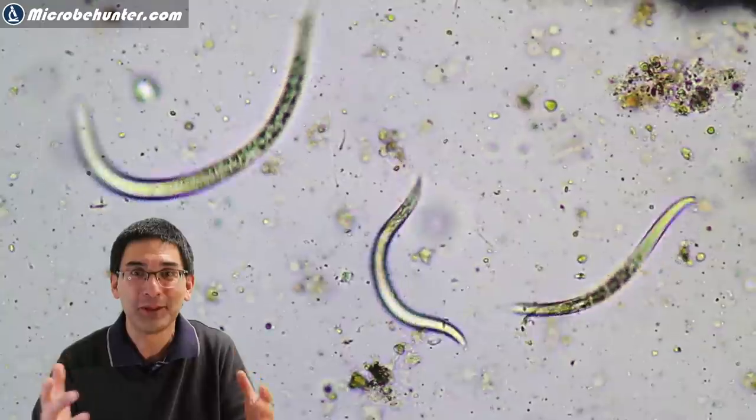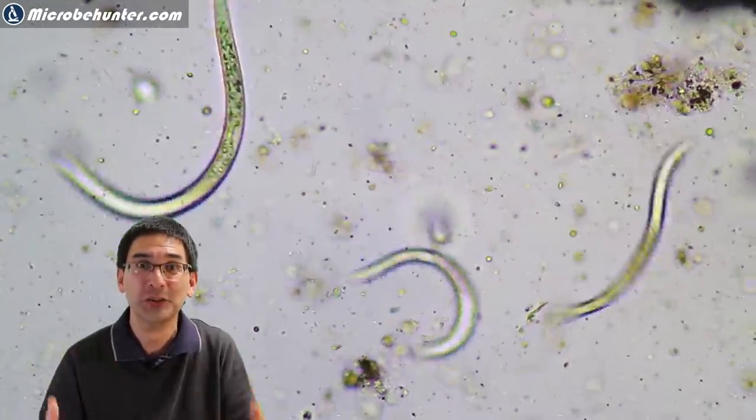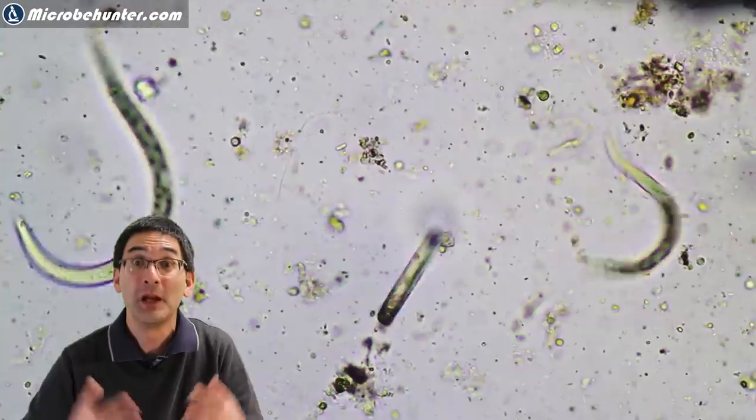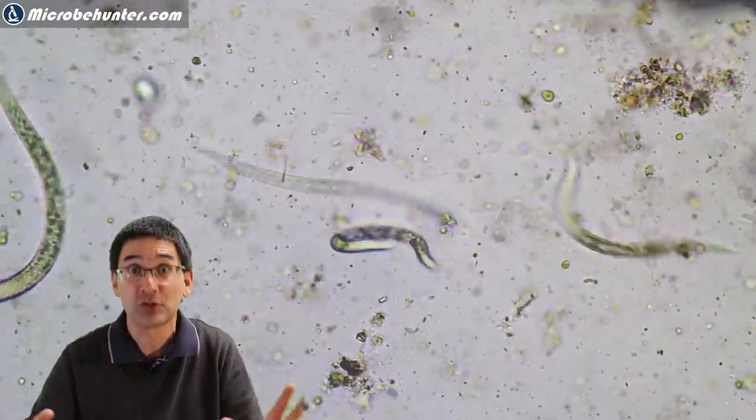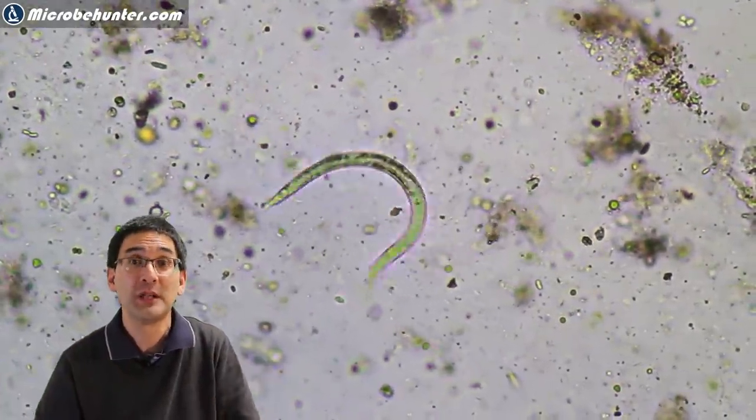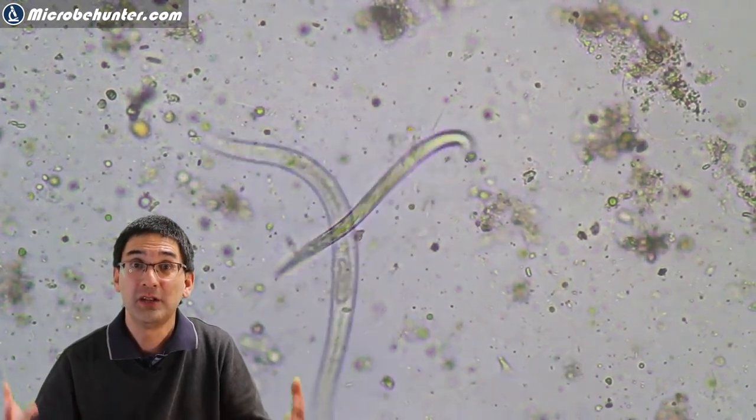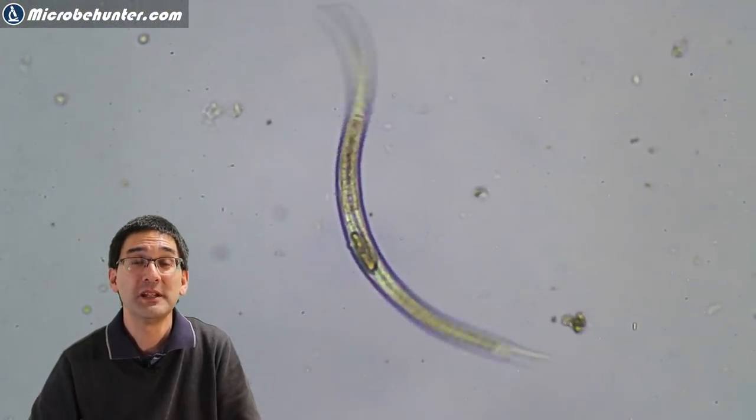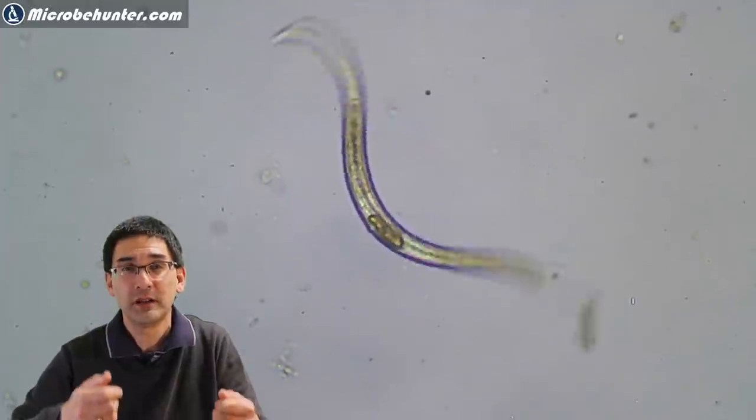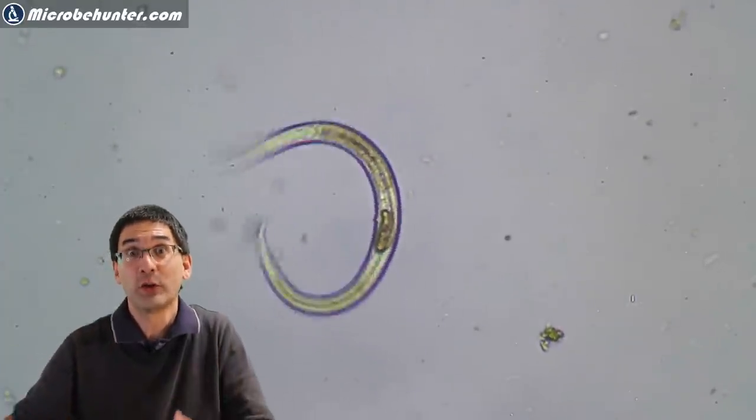And this is how real worms look like under the microscope. They are in water so they have to be surrounded by water because otherwise they would immediately die off. And so you can see that actually their movement is much stronger and the worms actually really look like worms.